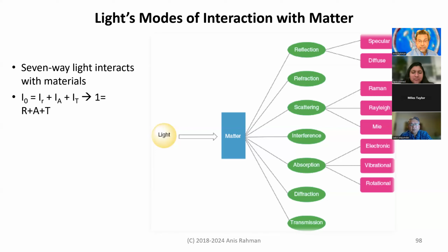And so what T-ray has as an advantage is that when you take a particular energy, for example infrared, that is sensitive to bond activities, bond vibration or rotation. But as a molecule, there are so many other motions or resonances in general that if we could probe, that gives us more information, more advantage. That's the whole point of T-ray or terahertz, because it is sensitive to all the resonances that may be present in a molecule.